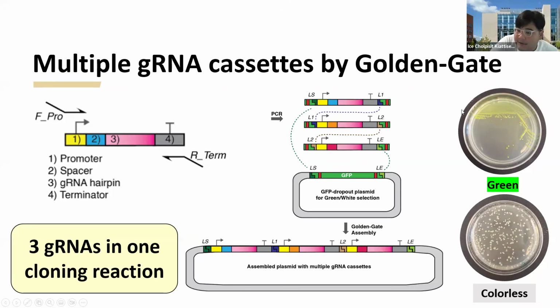I think right now, if you were to clone 3 pieces of DNA into the plasmid of interest, I'm going to go into Benchling and just show you briefly how we can generate this. But let's assume that we use other tools to design or generate these DNA fragments first. The DNA fragment that I'm going to show you will have some compatible overhang right here, where they use the type 2S enzyme that is going to recognize the red part right here, and then cut and give the sticky end that was specific, that can attach to this one.